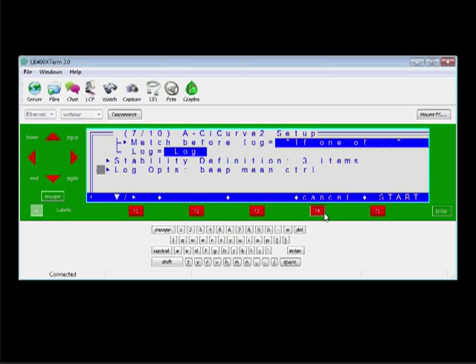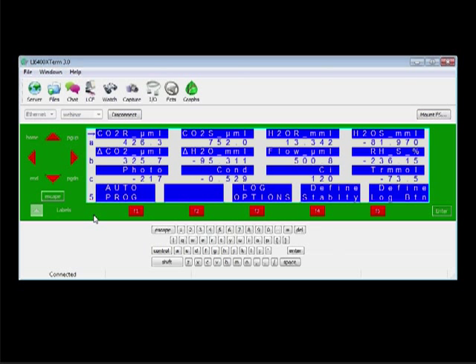I'm going to go ahead and cancel this because, as I said, I don't have a plant, so I don't want to actually take any measurements or start a CO2 auto program or anything like that. Ashley, do we have any more questions yet?